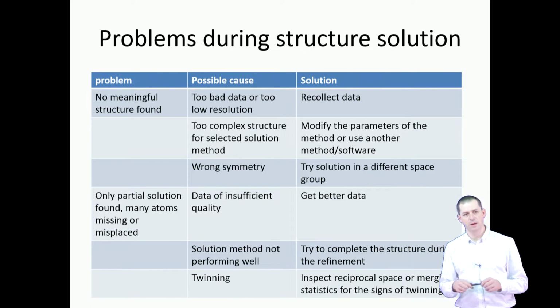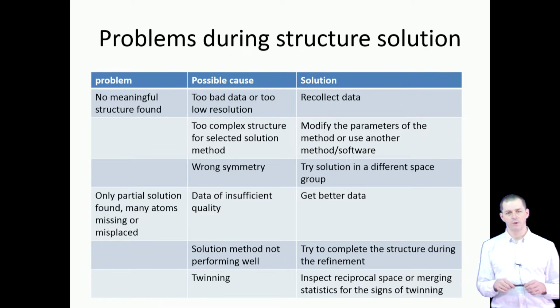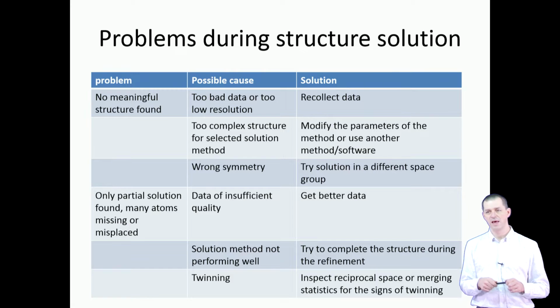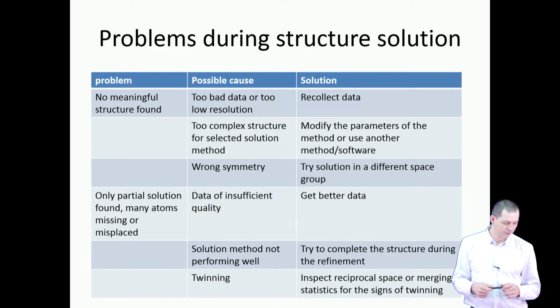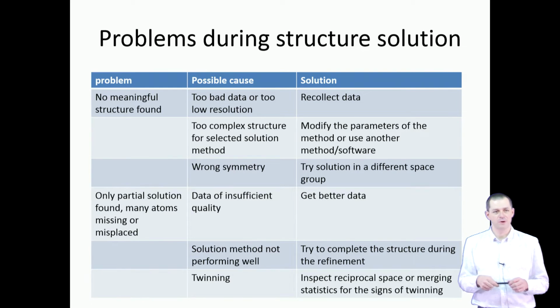It might be a good suggestion for improvement. I think the reason is that these statistics are reliable for light atom structures. For organics, they are quite reliable. For inorganic materials, less so, because these statistics are based on an assumption of equal atoms randomly distributed in the unit cell. And we know that real structures are all but randomly distributed sets of atoms, and inorganic structures are all but equal atoms in the structure. So if you have strongly differing atomic species in the structure and atoms on special positions, this statistics may give you a hint, but the hint may be equally well wrong as right. So finally you have to try both options anyway.